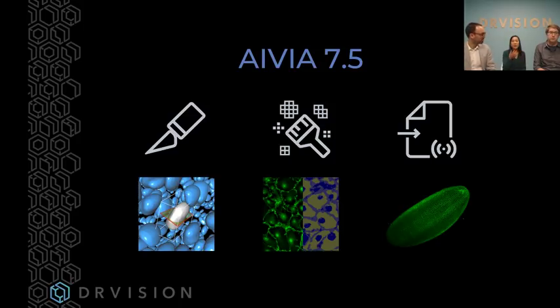And then when you are making all of these edits and changes, do the measurements get automatically updated in Aivia, or is this something that we have to do? Absolutely. That's really critical because the key reason we created this tool is for editing. Initially, it was for editing tracks. So when you have an object that gets to a point, and for some reason our algorithm detected one object, but really there were two cells in that spot, then the track will be wrong. So we have to go in and cut that big surface into two surfaces, and when you do that, it will update all the track information, and you can continue with the track editing after that.